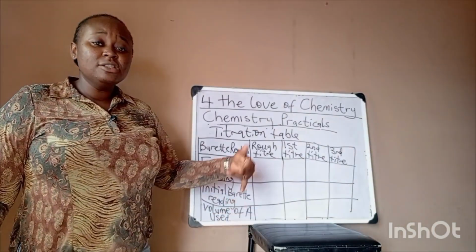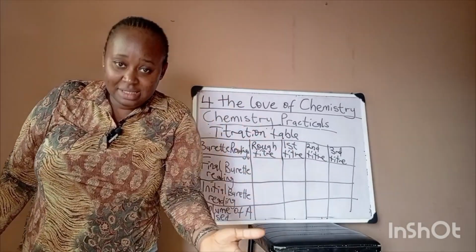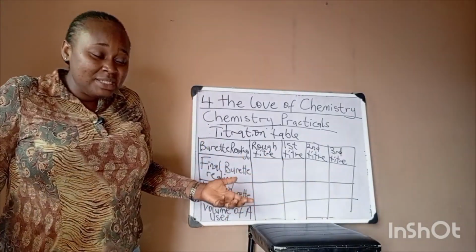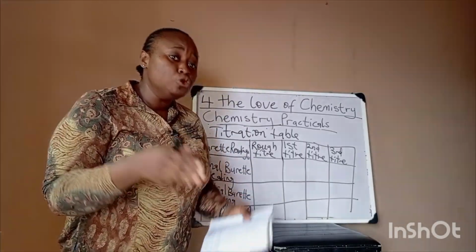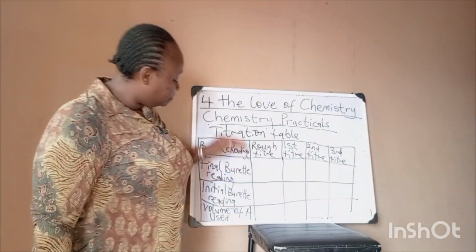So A is subject to change. A can be acid, is usually acid, but most times they still use an oxidizing or reducing agent depending. So I don't want you to be stereotyped. I want you to understand this so that whatever you are given, you are able to do what you ought to do.